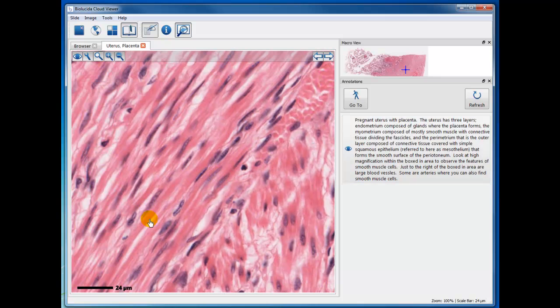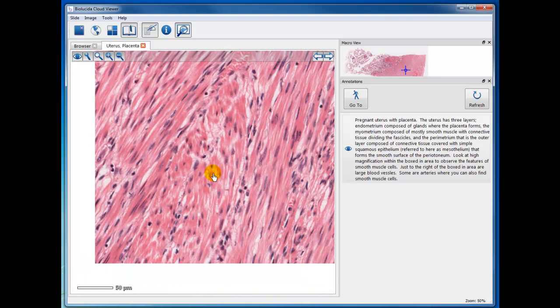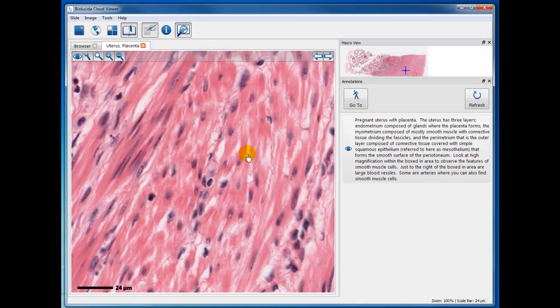where you can see the smooth muscle cells with the very long nuclei that, when they contract, can actually become corkscrew shaped, because this nucleus doesn't change size, it just gets scrunched up upon contraction. And over here, these are cross sections, but they're slightly oblique.